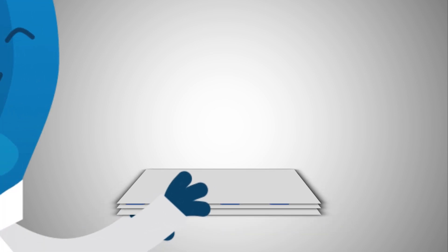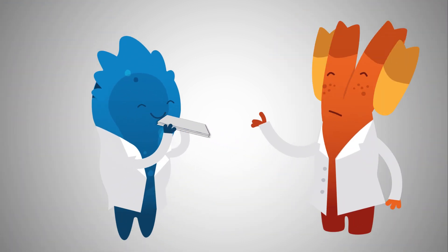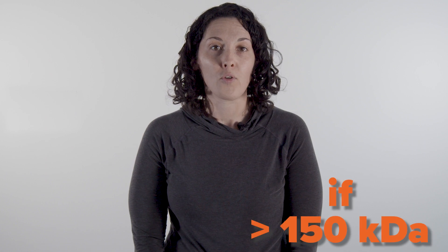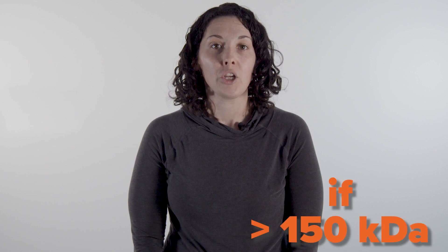One quick reminder, the transfer sandwich is not for consumption. Two quick transfer tips. If you're using PVDF to transfer, be sure to activate the membrane with methanol before use. For a dry transfer, you must pre-equilibrate the gels if the protein target is over 150 kilodaltons. To do this, soak the gel in 20% ethanol for 10 minutes before assembling the transfer sandwich.